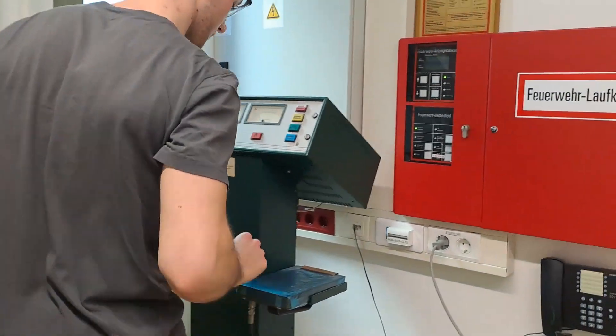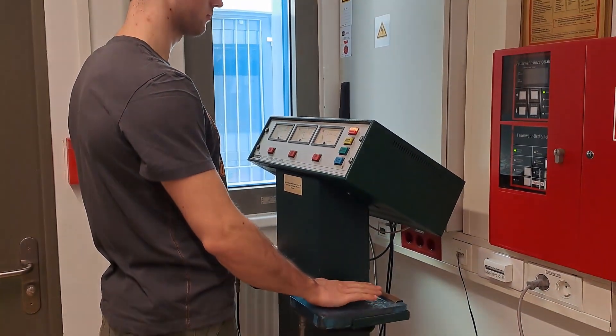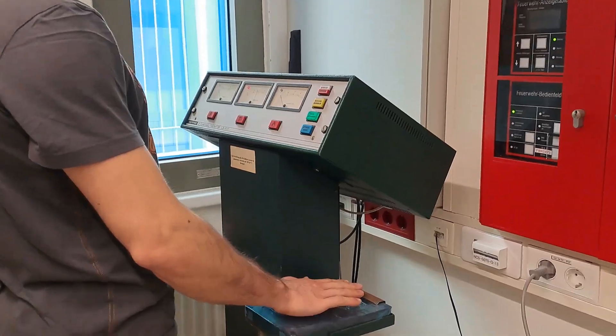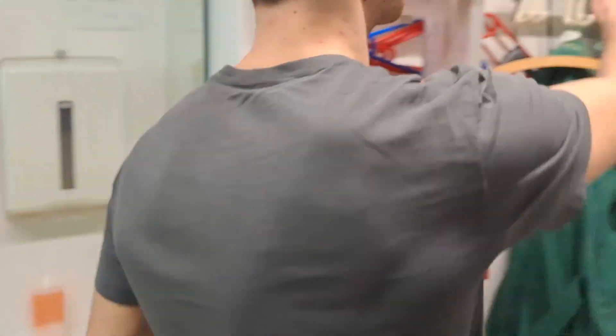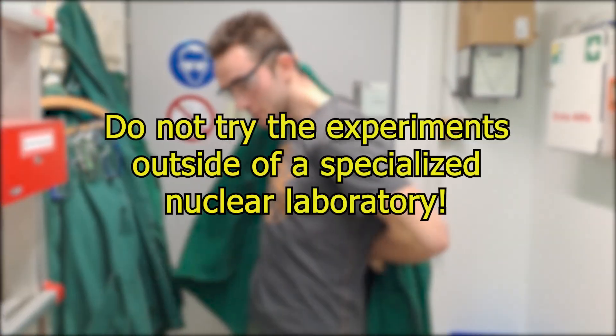The start of what I hope will be a very informative video series in which I will show you some historically important experiments in nuclear chemistry, right up to nuclear fission.